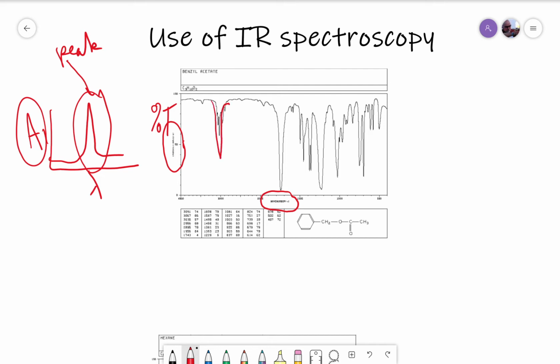So in an IR spectrum, peaks hang from the ceiling instead, sort of like a stalactite. So things that come down are the peaks. And instead of wavelength, we have wave number, which is that reciprocal centimeter, or 1/wavelength, that we had talked about before.